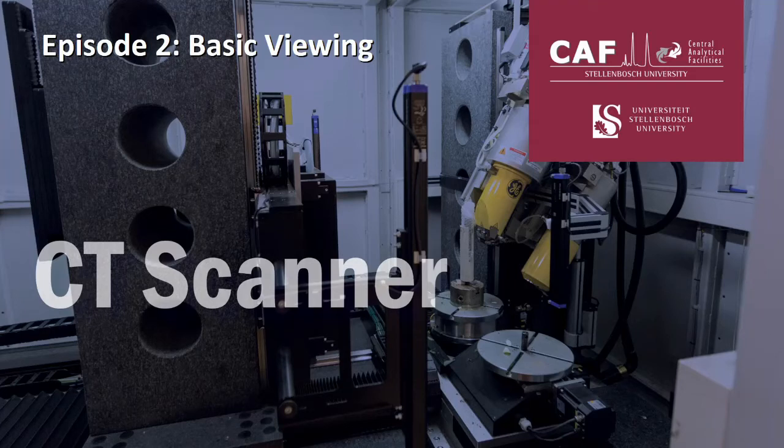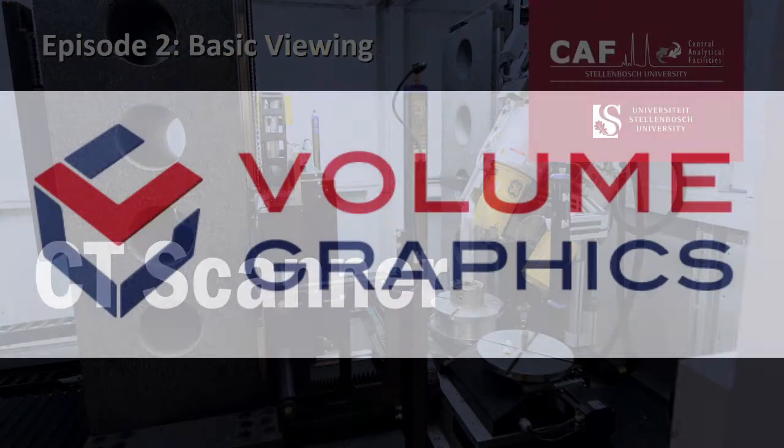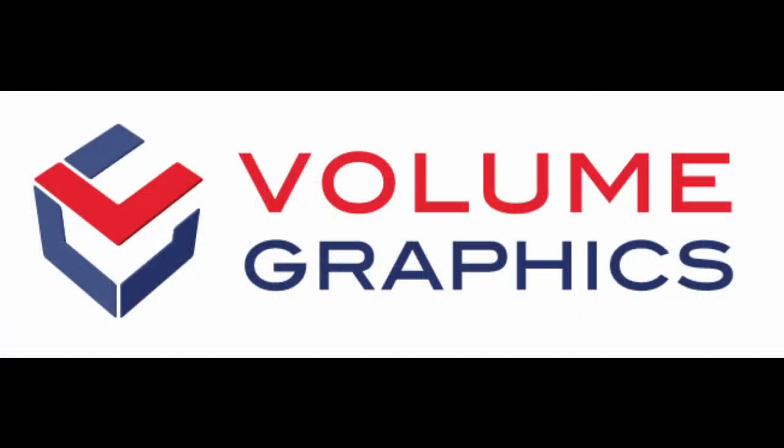Hi and welcome to the Stellenbosch CT scanner facility. This is the second video in our series to guide you through the process of viewing your CT data for the first time with Volume Graphics MyVGL.